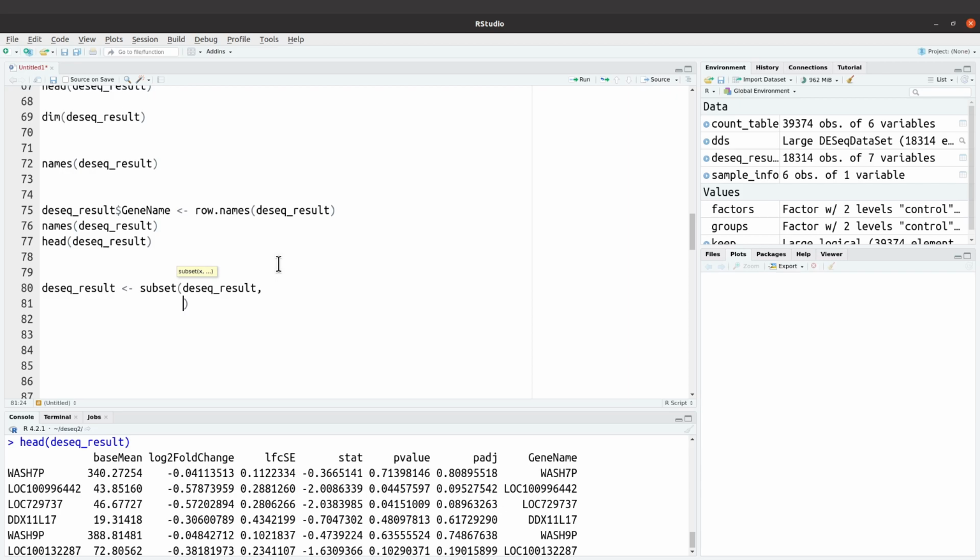and I'll move to another line and say select equals c. Now I'll bring my brackets. Then in the brackets, I'm going to specify the columns, in the order that I want. So this is what I'm going to do. I'll just paste it.